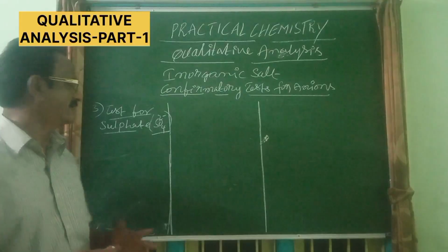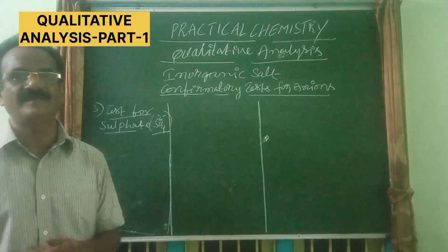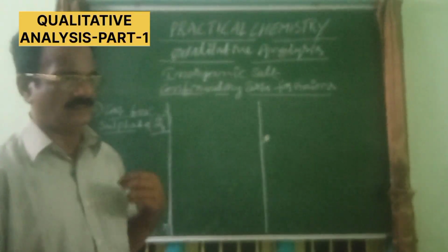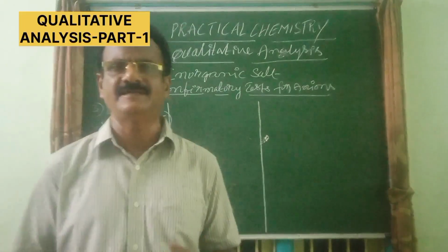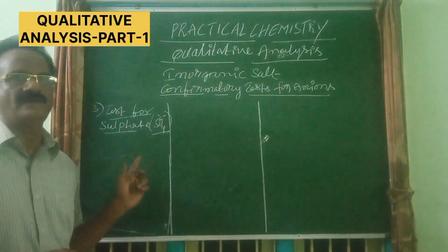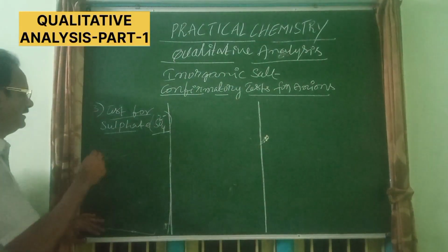Let us see the confirmatory test for sulfate. If sulfate is identified in the identification tests, then one has to confirm the presence of sulfate by doing this test.